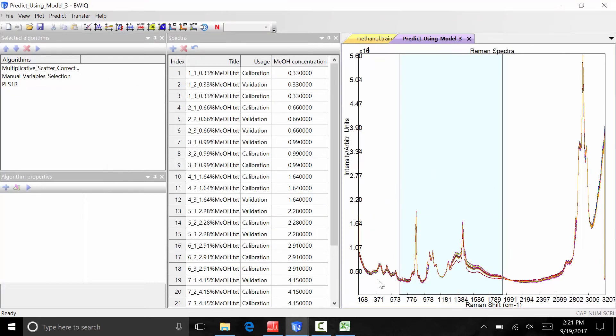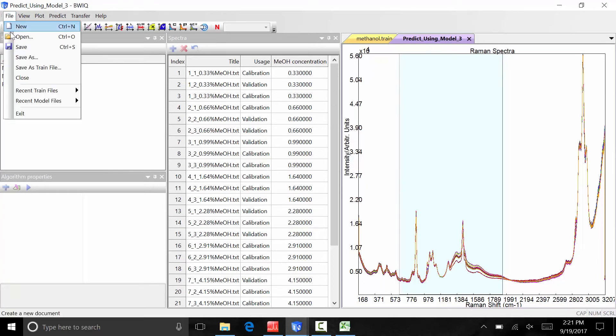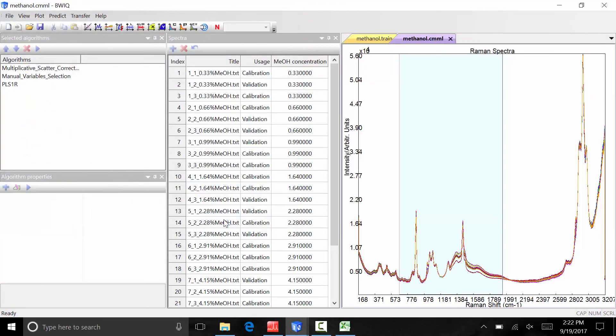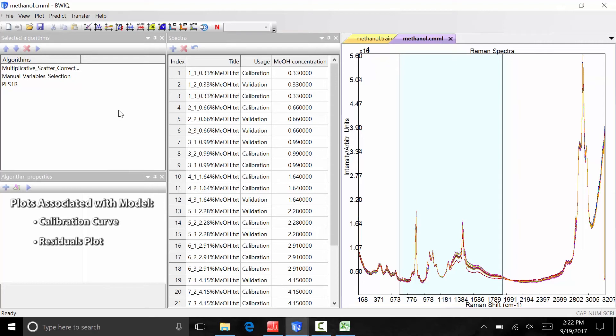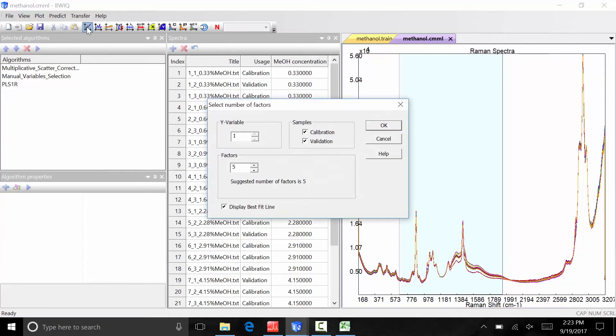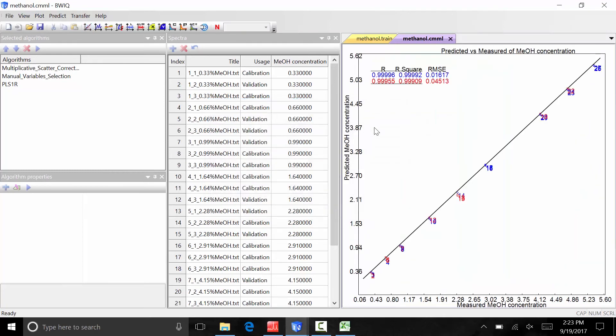The toolbar that now appears in this model window can now be used to view the plots associated with the model including the calibration curve, residuals plot, and loadings plot. To view the calibration curve of the model, you can click on the first icon for predicted versus measured. The software automatically calculates the number of factors that best describe the data. Click ok to view the calibration curve.